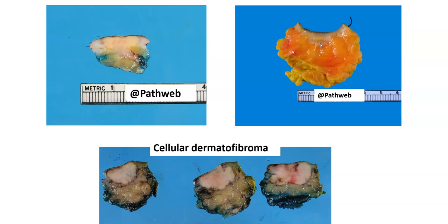Here is another example. On the cut surface, you can see a not so well-defined area of whitish discoloration extending from the dermis into the superficial subcutis. Here is another example — this is a cellular dermatofibroma, one of the variants. This lesion tends to extend a little bit deeper into the subcutis, and you can see that it is a little bit more well-circumscribed than the others.